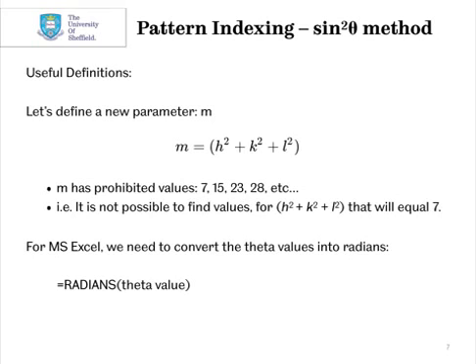Some other useful things that we can define. Let's make a new parameter m, and m is just going to be the sum of h² + k² + l². You'll notice that it's not possible to find values for certain combinations of h, k, and l that will give the particular values 7, 15, 23, 28. So if you have a 1, 0, 0, m would be 1, a 2, 0, 0, m would be 4. It's not possible to get a combination of h, k, and l that will give you m equals 7, for example. And this will be particularly important in a short while.